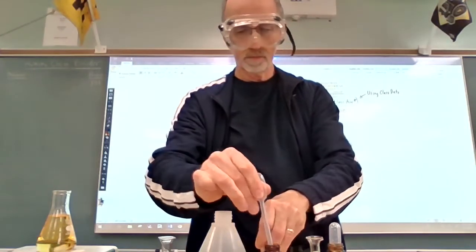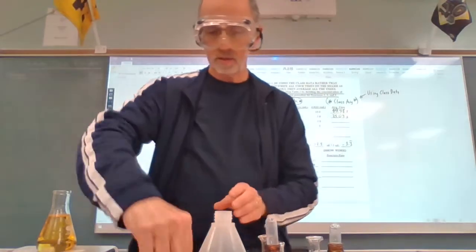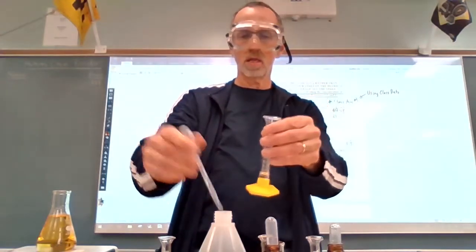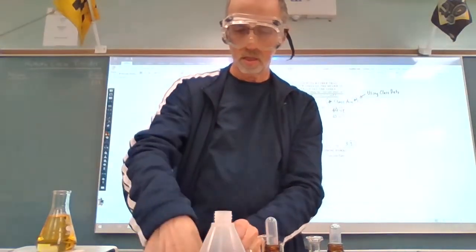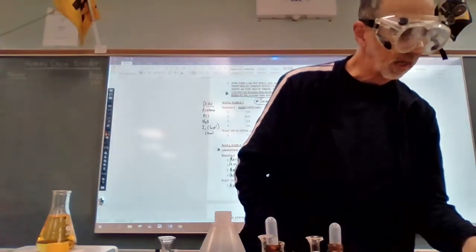Okay. 5 water. Okay. And this time the iodine is again 5.